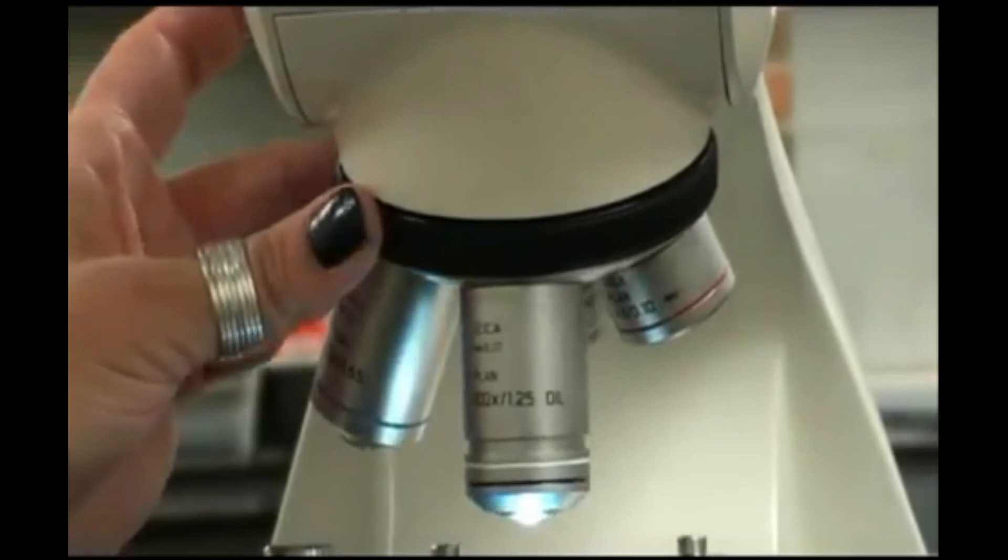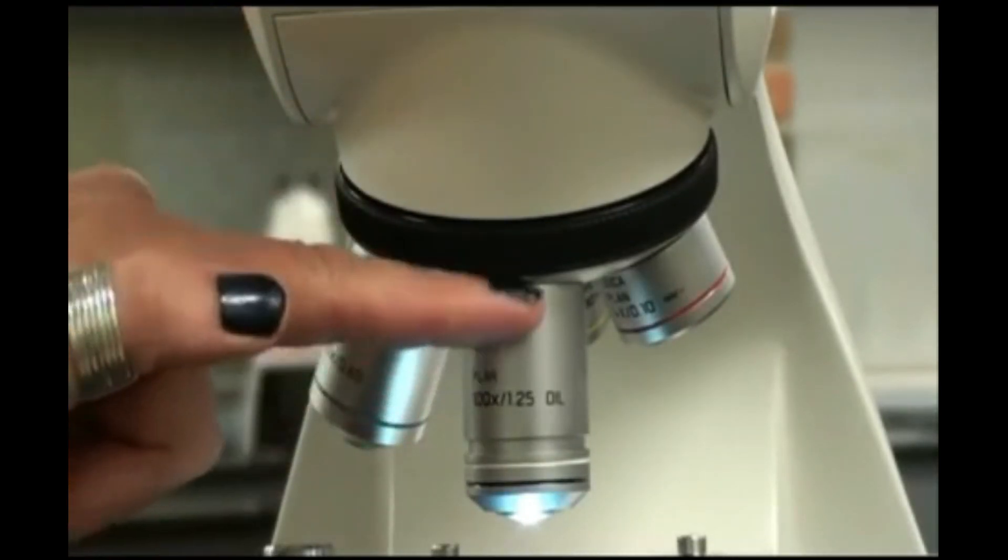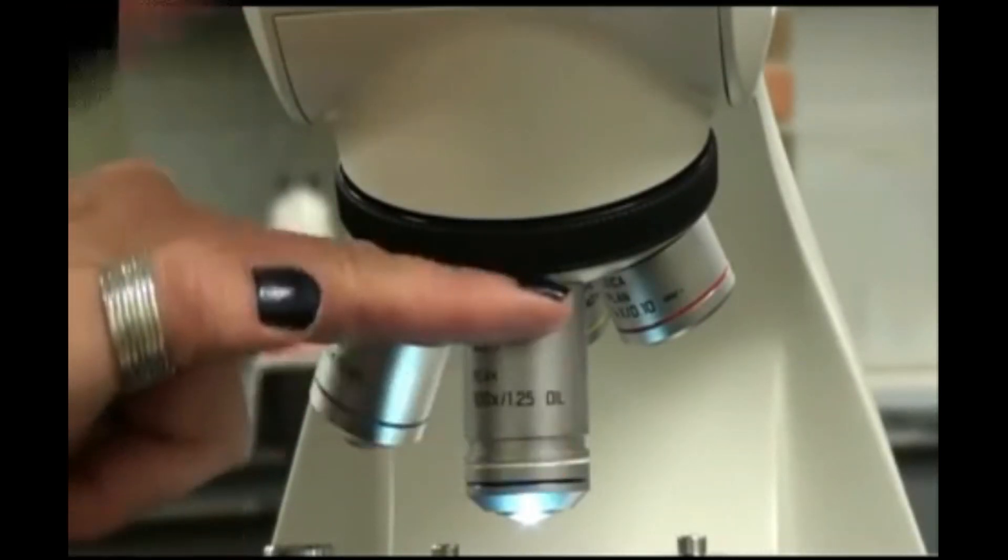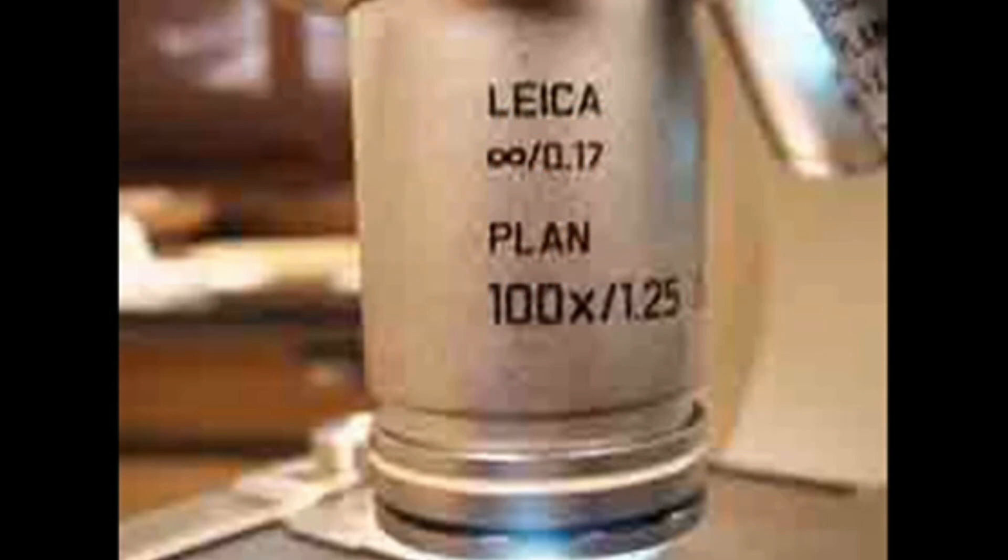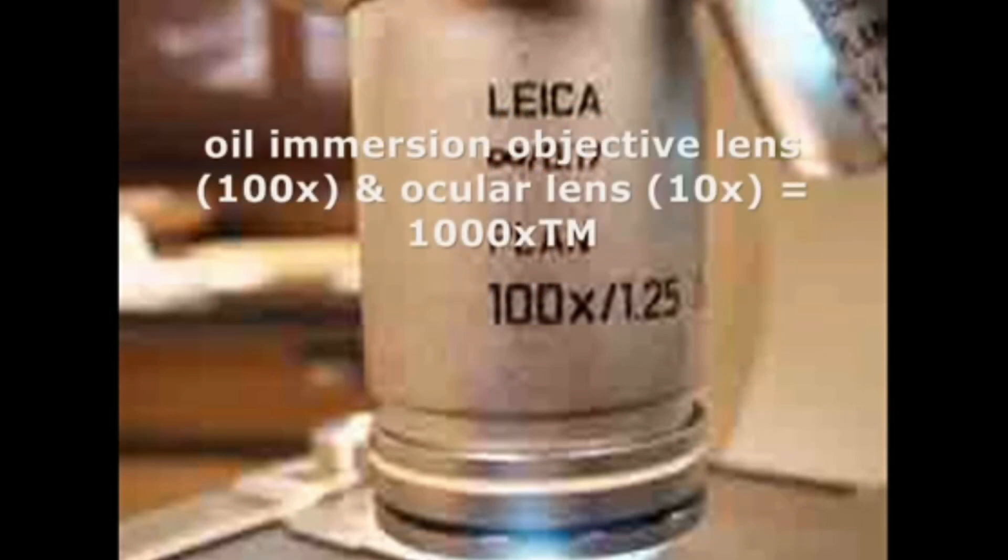Compound microscopes typically have three or four objective lenses. If you do have a fourth lens, that would be the oil immersion lens. It has a black and white band around it. It magnifies objects a hundred times actual size. So together with that ocular lens of ten times magnification, I can get a total magnification with oil immersion of one thousand.